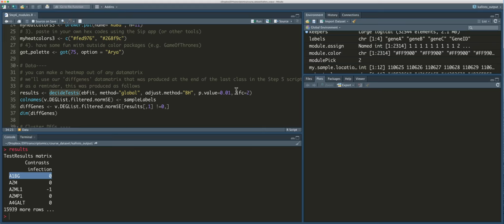And we talked about how you could string together multiple of these Boolean operators, effectively pulling out any portion of a Venn diagram representation of your differentially expressed genes, or all differentially expressed genes, which is what we did. And when we finally produced that object, it had 2,314 rows, or differentially expressed genes, and our 10 samples.